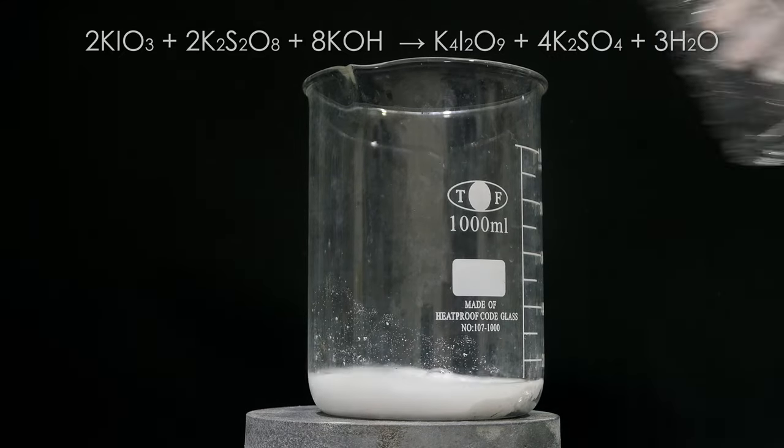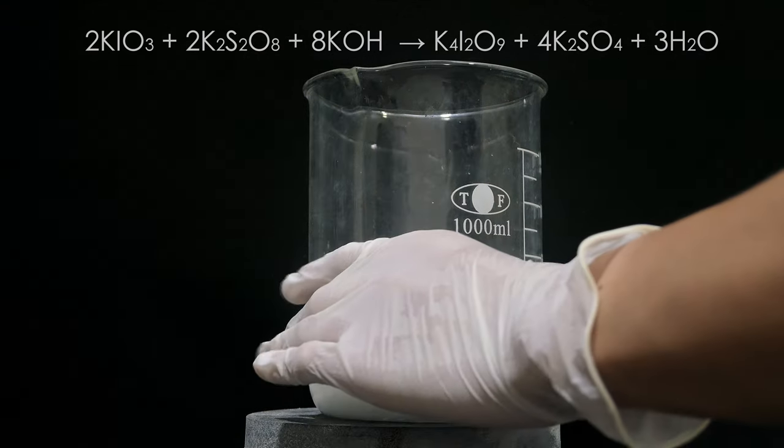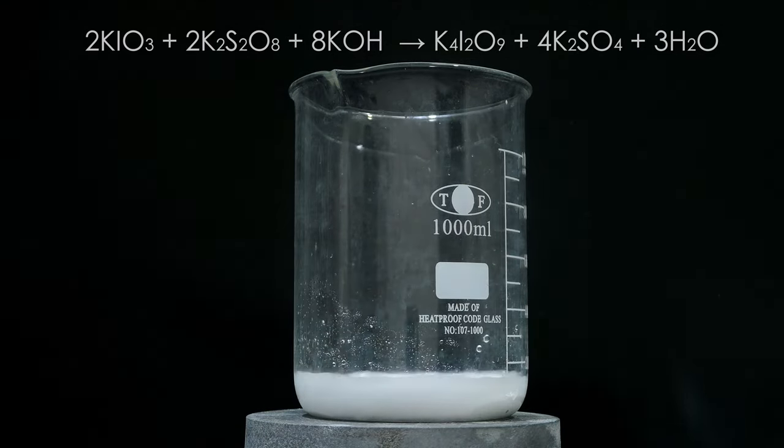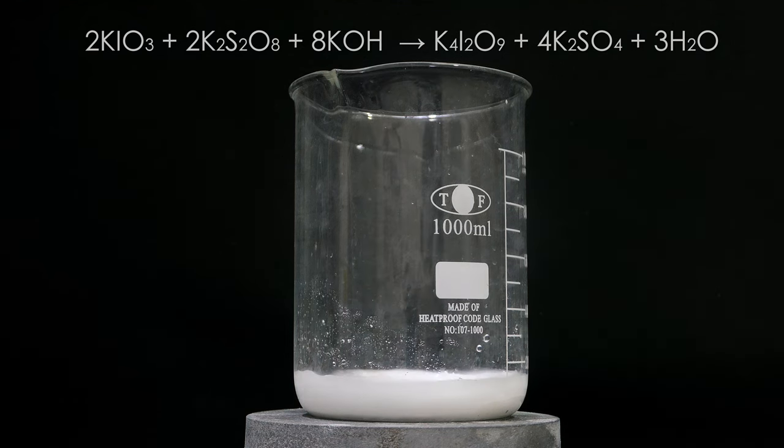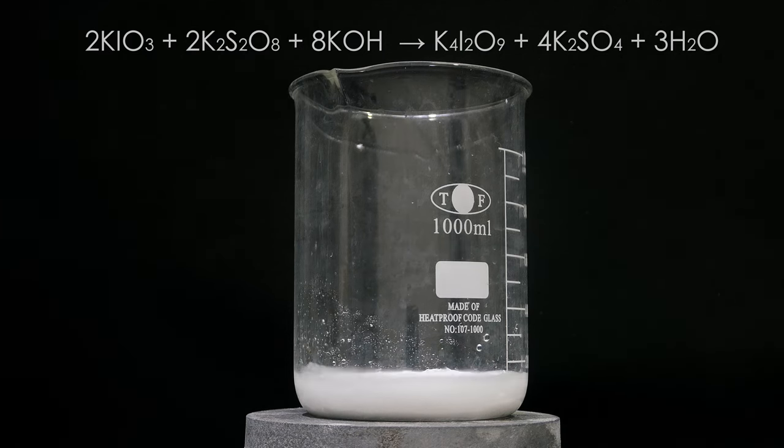The next step is to convert iodate to periodate. Normally this is done by bubbling chlorine gas, but this is not only toxic but also hard to control. So I am taking another approach, using potassium persulfate as the oxidizer. First, 33 grams of potassium iodate is dissolved in about 100ml of water.